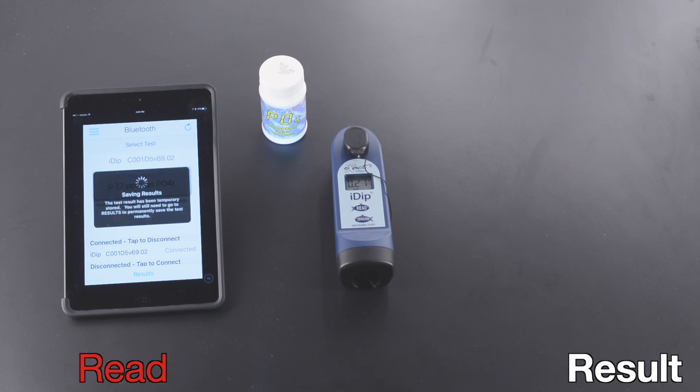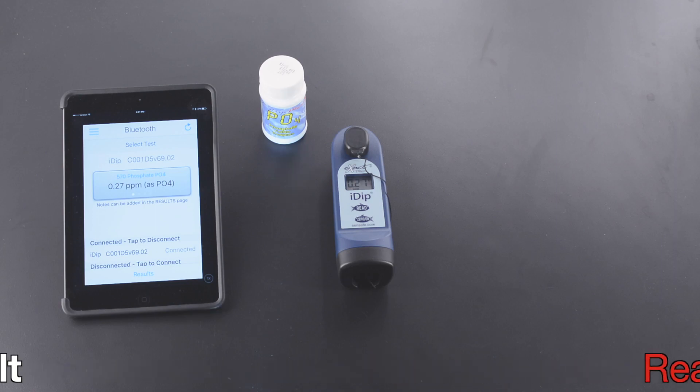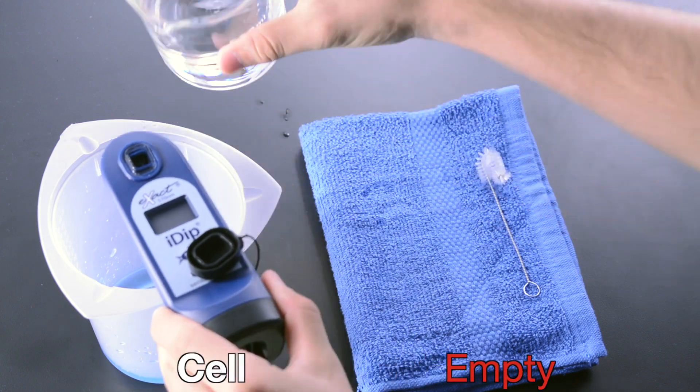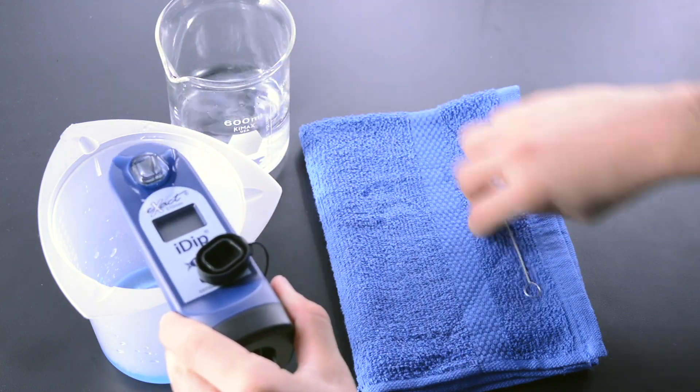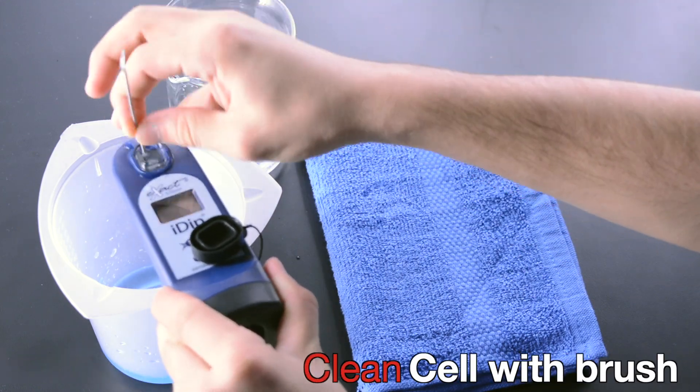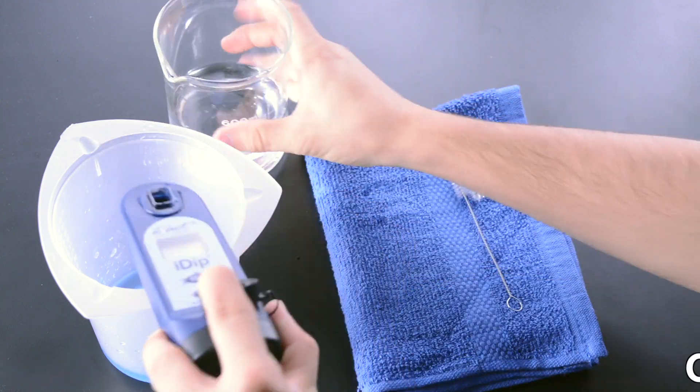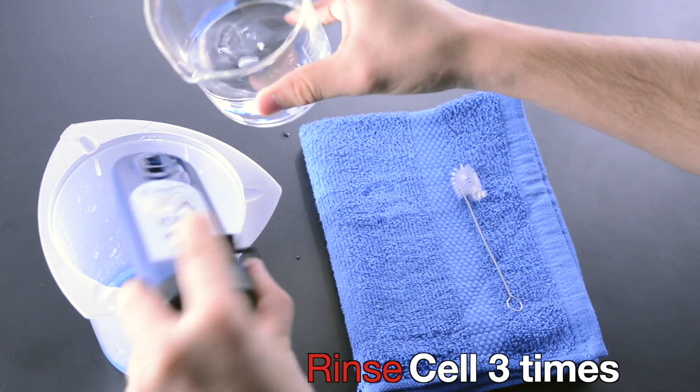Read the result, then empty the cell. Clean the cell with a brush and rinse it three times.